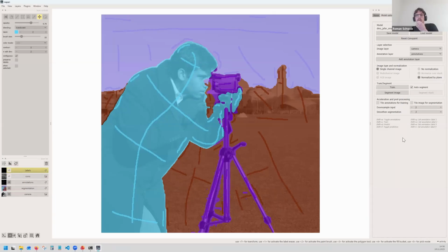And now maybe I can address your question, Daniel, about training on multiple images. It's inherently possible to do this in Convpaint. It's super straightforward in the API, and it's going to be one of the next things that we add again in the plugin.